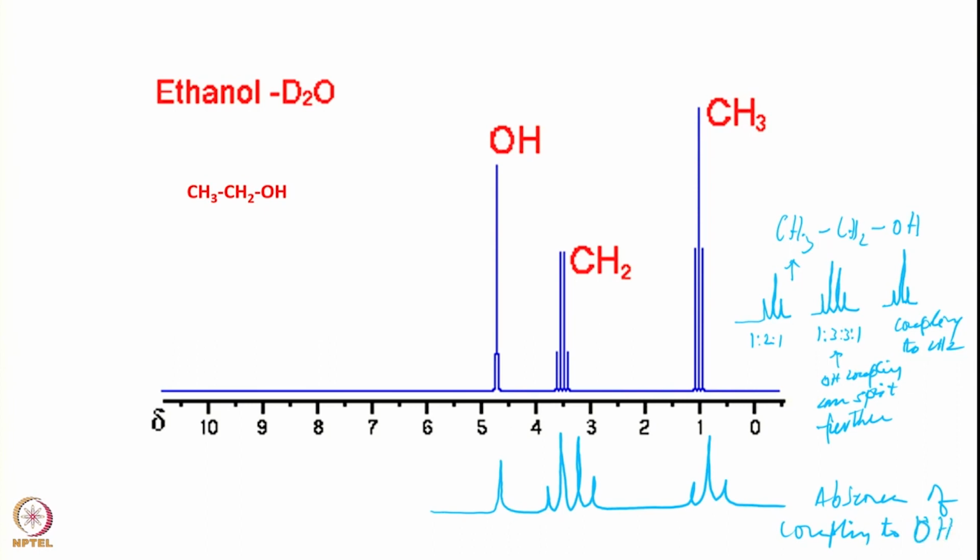Now, however, if you look at the original spectrum, the CH3 proton has much more intensity. What are the intensity ratios here?